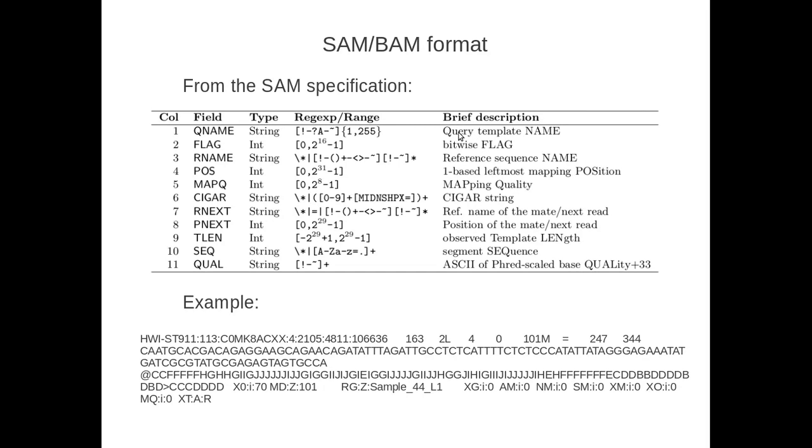There is redundant information in BAM files because a BAM contains in one record, or one line of the file, the information for a focal read and its mate. Its mate's information is here. So a second line of the BAM file will contain this other read, the mate of the focal read, as the focal read in another record, and the mate here will appear as RNEXT and PNEXT, or its information will be in RNEXT and PNEXT.